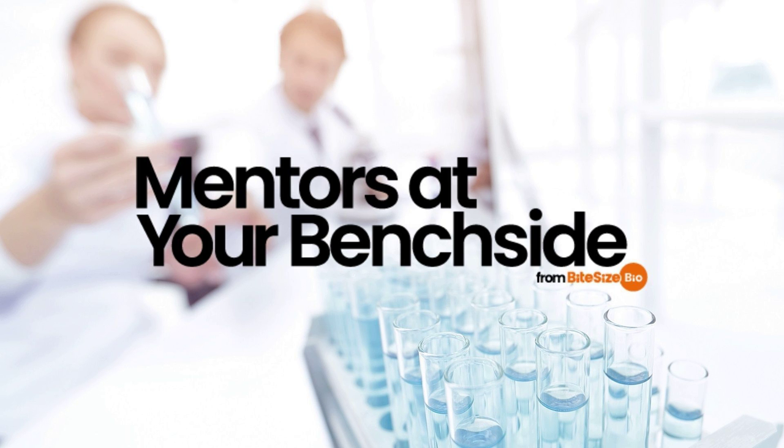Now, the OD600 is not an absolute value. The OD value represents the amount of light that is scattered by your sample, but that value is affected by the intensity of the light beam in the spec and the spec design. This means that similar samples will give completely different OD values in different specs, owing to the specs having different bulbs, or even in the same spec over time as the beam intensity reduces with the age of the bulb.